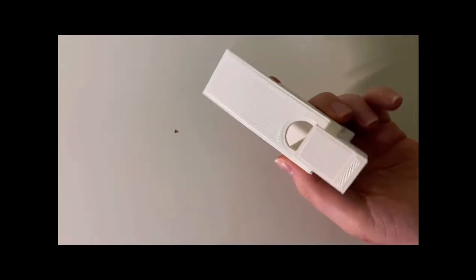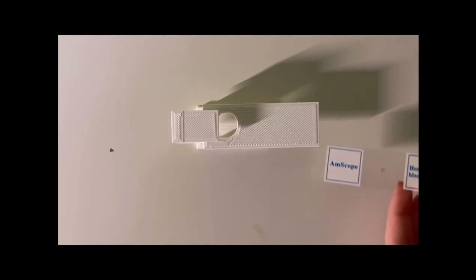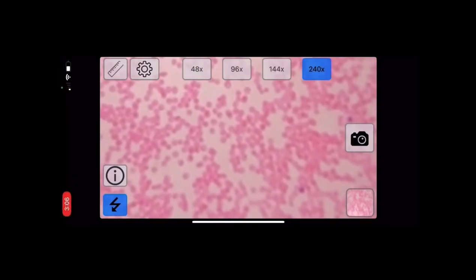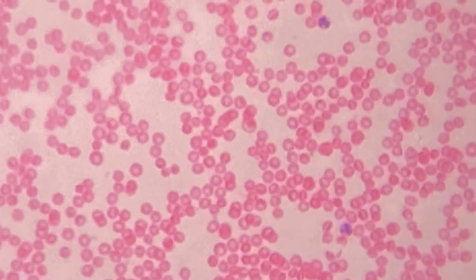We designed a 3D printed phone attachment that can hold a slide and microscope phone lens in place. Using a convex lens that points all of the light to a specific focal point in order to achieve sufficient magnification of at least 400 times, our design has an advantage over a traditional microscope due to its ease of use.